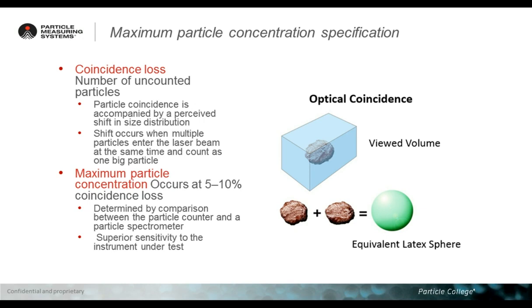As I said, particle counters available in the market don't have any problem dealing with ISO class 8 or even dirtier areas. But in case you are going to perform tests like recovery tests, which require the use of a particle generator or smoke generator, make sure you do not exceed the maximum allowed concentration. And if this happens, make sure you use an appropriate system, normally called a diluter, to avoid the instrument having to deal with too high a concentration of particles.